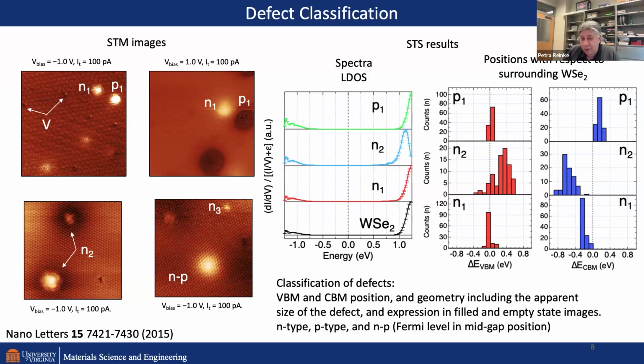So these are the first 4 images I wanted to show you. And you can see also, which is something we do pretty often, the question of how to beat the statistics in this case. That continues to be a challenge in STM imaging as well as spectroscopy, because you image a relatively small area, but you would like to get a really comprehensive view of your defect distribution.